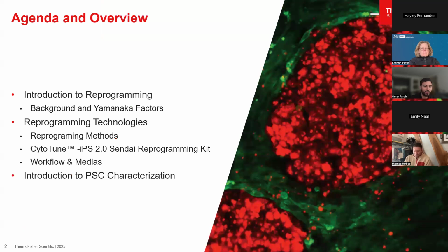So for today, I'm going to be giving you a brief introduction into reprogramming, giving you a little bit of background and talking about the Yamanaka and reprogramming factors. We're then going to do a slightly deeper dive into the different reprogramming methods and technologies.